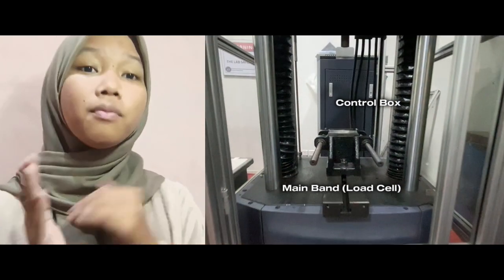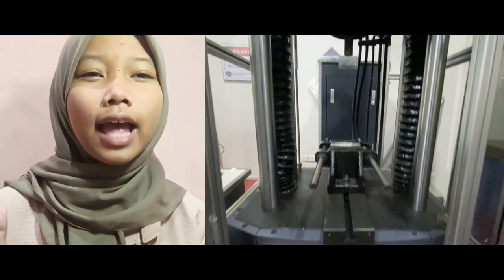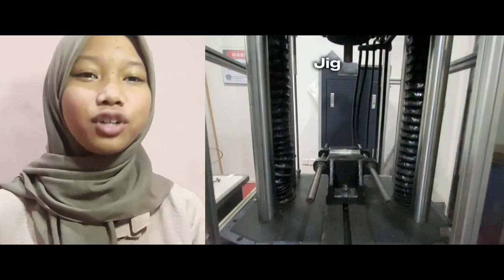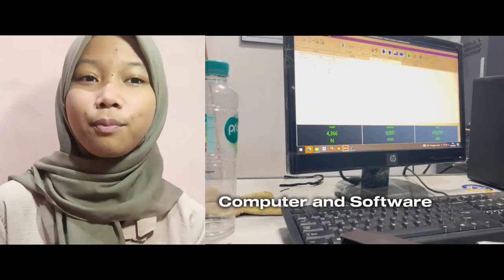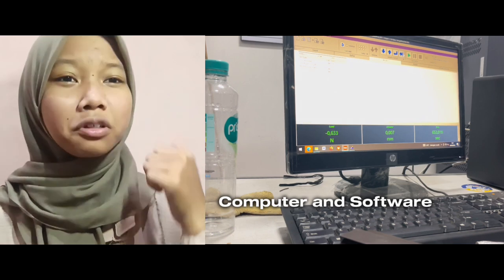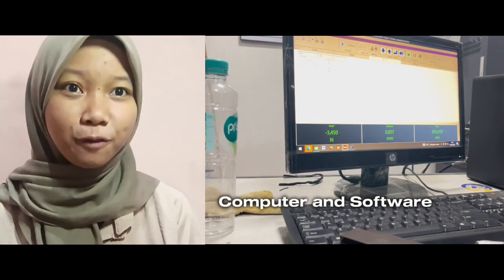The load cell measures the applied load and sends data to the computer. The control box, located at the back, contains the hydraulic and electrical system. Okay, the last is the computer and software, which process, calculate, and display the result in numeric and graphical form.